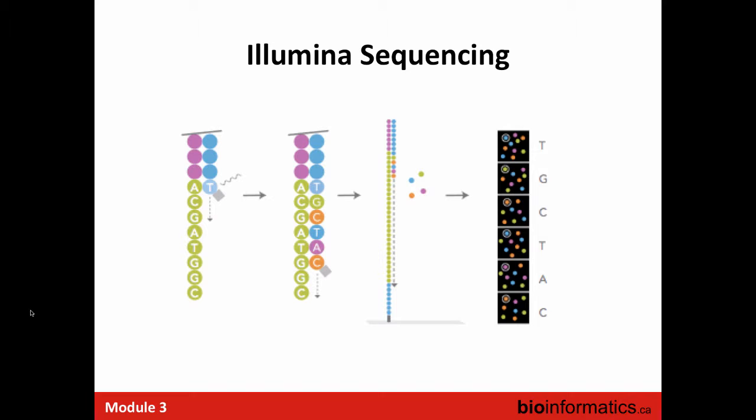So usually, you have to fairly carefully control the concentration of DNA that you add to the flow cell. If you add too much, the density is too high, and you start to get overlapping clusters. So the software that does the base calling will try to detect that, and then either it will say, okay, these clusters aren't useful for sequencing, or it might just get confused if it can't detect those. So you want to try to get your concentration in the Goldilocks range, where it's not too high, where you're getting overlapping clusters, but it's not so low that you're just not sequencing very much. Oh, and if you're at the perfect spot, you get more throughput. Exactly.